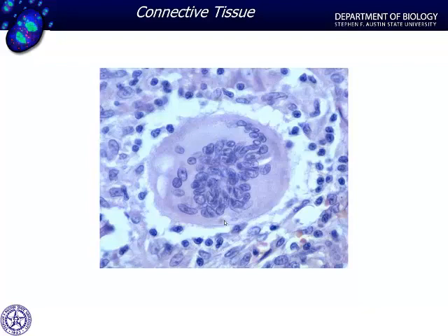Now, if we thought macrophages were big, this is probably the size of a macrophage that you would see, just a solitary macrophage. Now look at this monstrous cell. I don't know if you can even count the nuclei, maybe 40 or 50 nuclei in this one particular cell. But that's a foreign body giant cell. It has the same function as macrophages. Why they fuse together, I think the jury is still out on that, but we want you to be familiar with those.